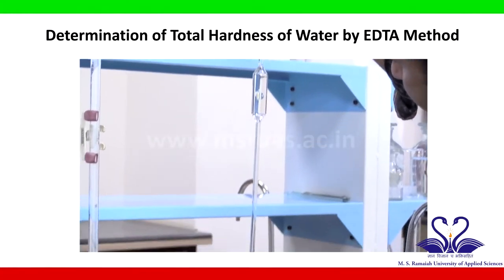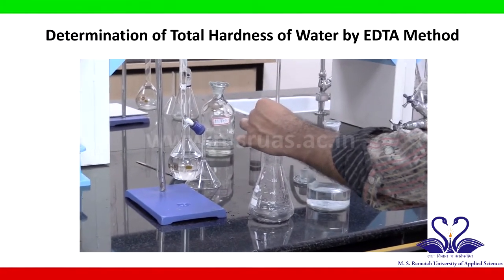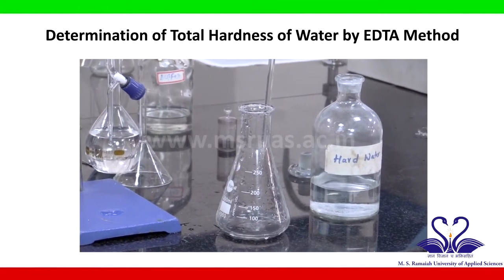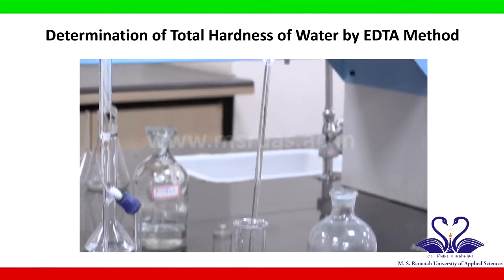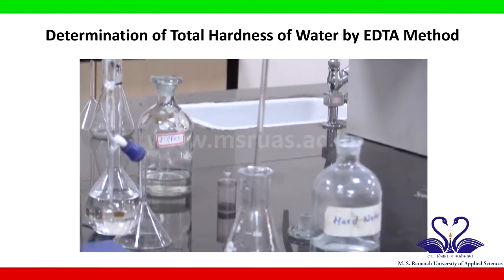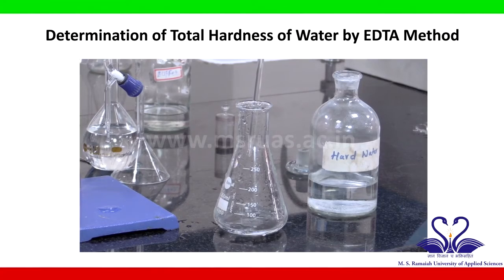Yes, the lower meniscus should touch the mark. So transfer completely 25 cm cube of hard water sample to the conical flask.